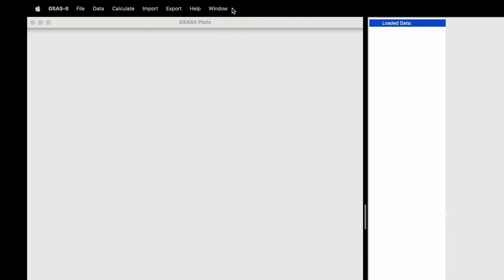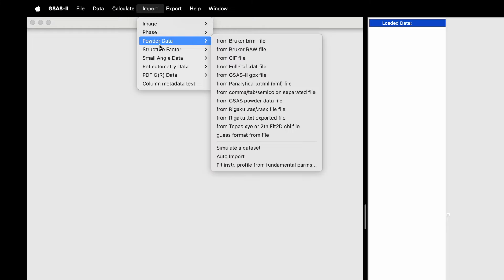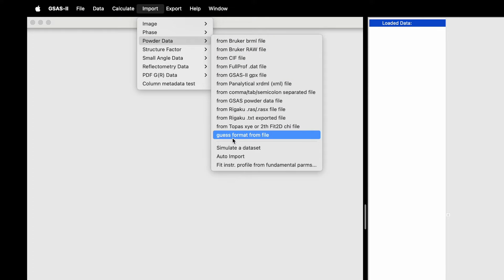Open GSAS-II software, click on Import, go down to powder data, then go down to click on 'Guess format from file.'